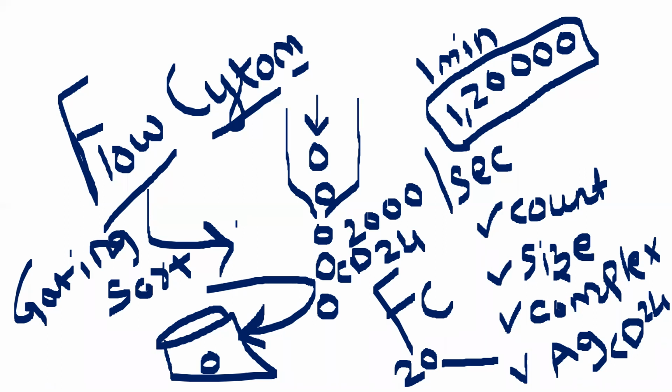So I will go to the next slide. Now I will show you the basic principle of this flow cytometer. The flow cytometer has the following components. I'm writing the components of the flow cytometer. It has a fluids component. It has lasers.